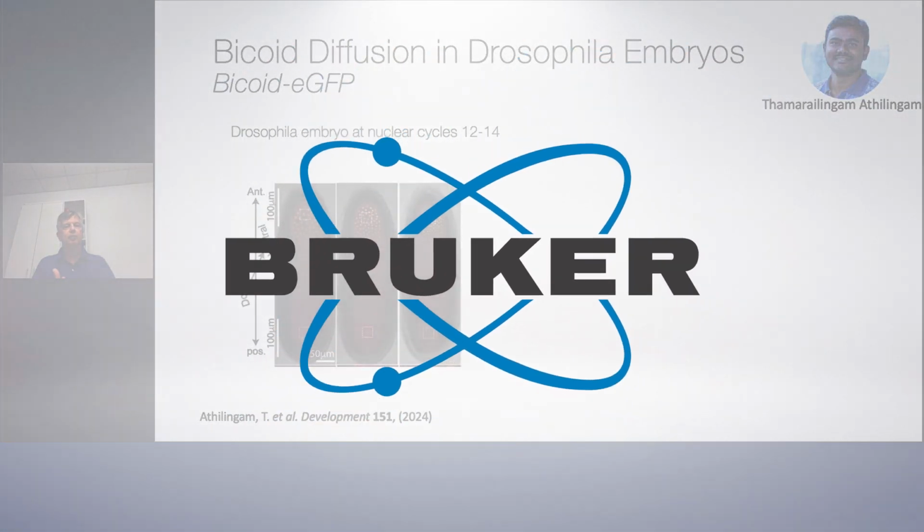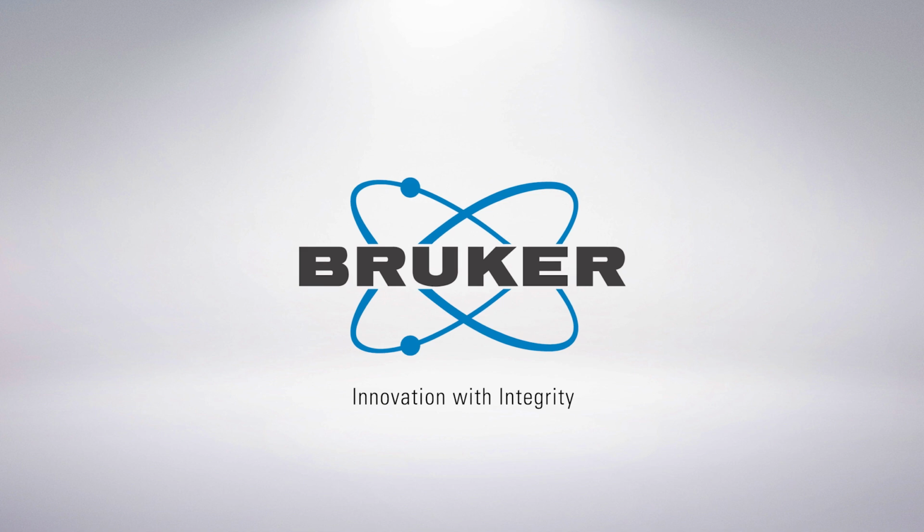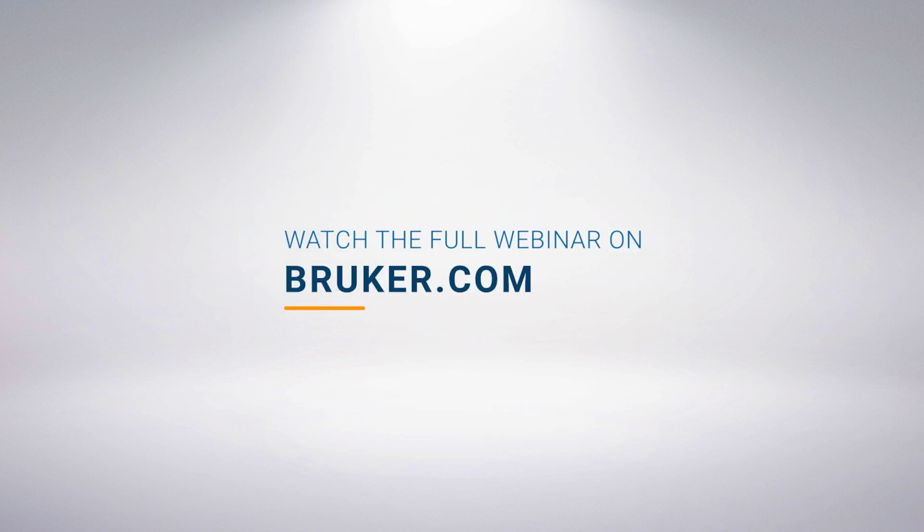Okay, let's start with a couple of examples. The first example is EGFP, it's actually the transcription factor Bicoid in Drosophila.